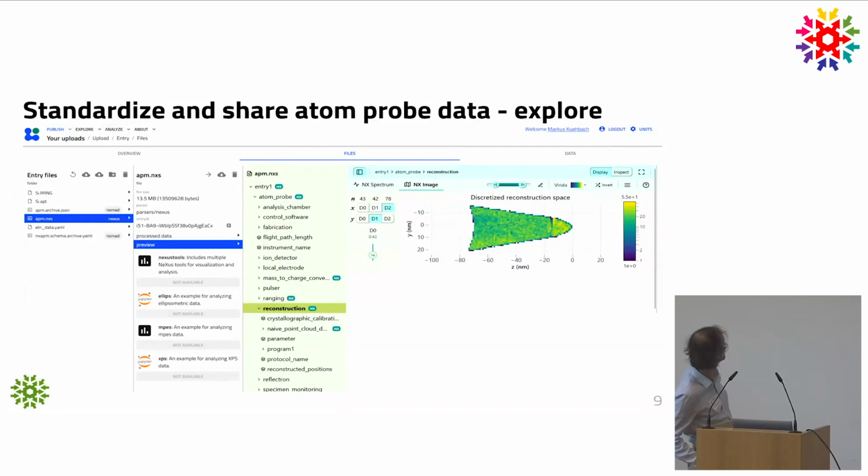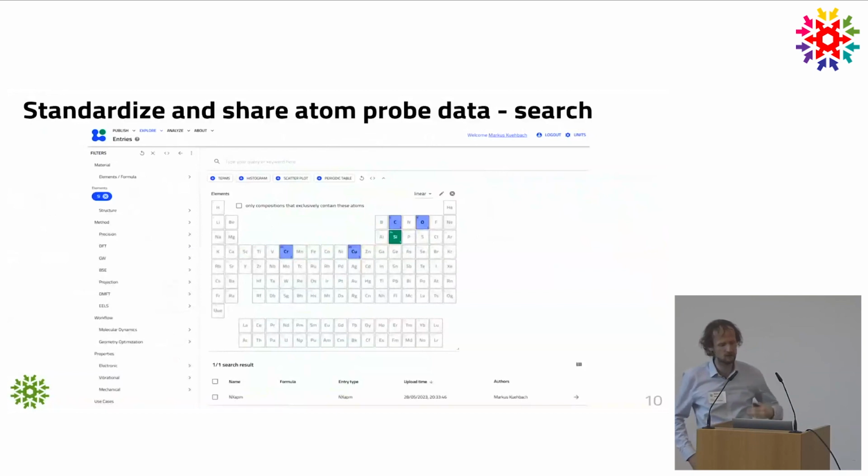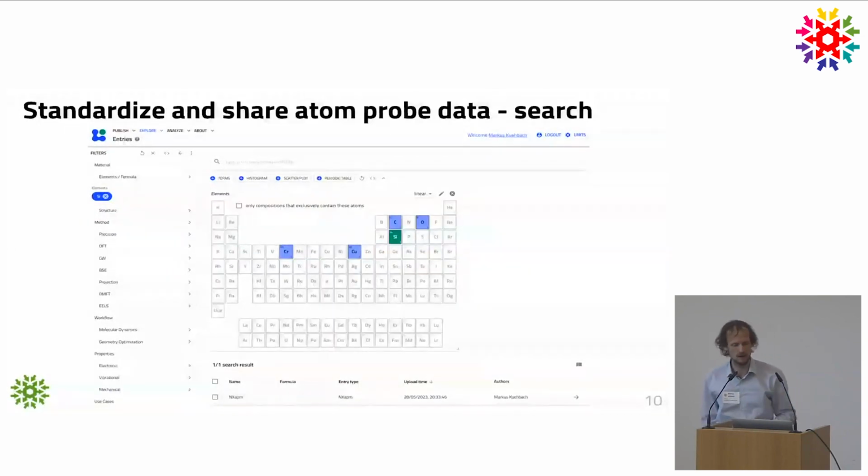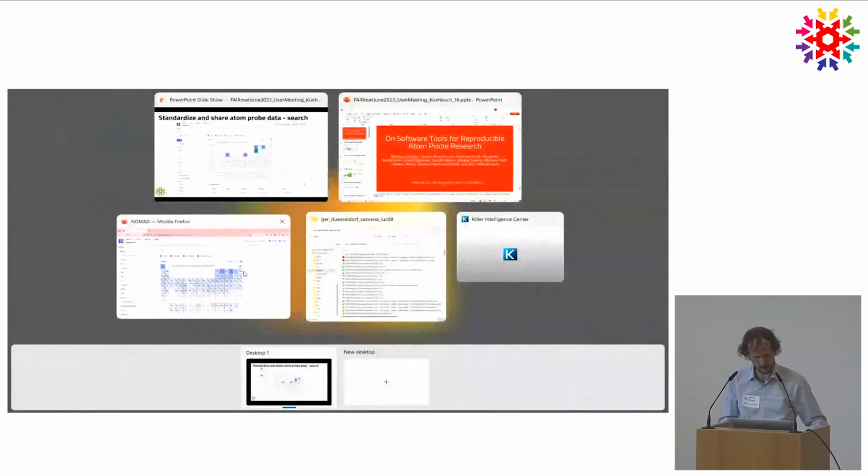That's also what's showing up in a slide from Christoph, and you can slide them through. And then if you have these data artifacts in NOMAD, and if you were to upload more data sets, you can then take advantage of search capabilities. That is very similar to what Andrea showed, and that's also available in commercial software. But keep in mind that here you could mix this up, and maybe I take this even though that might be dangerous, but I do it now.